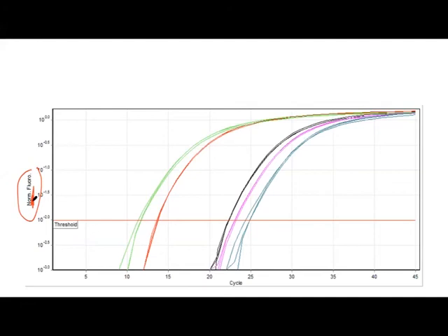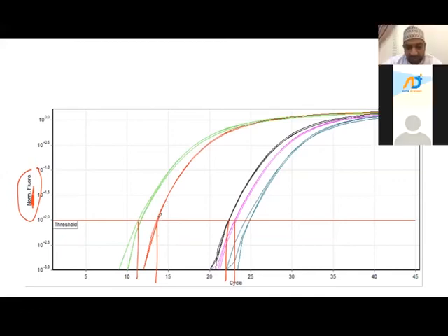of real-time PCR. Now, these samples, all of them, you can tell you that the CT value, if this is the threshold line, the CT of this is around 11. This is around, like, for example, 14. The software will tell you the CT value. It will draw lines for each of these samples. And usually we run sample in duplicates, which is a good practice for you. So when you have good pipetting, it will give you the same CT value for the average of the sample.